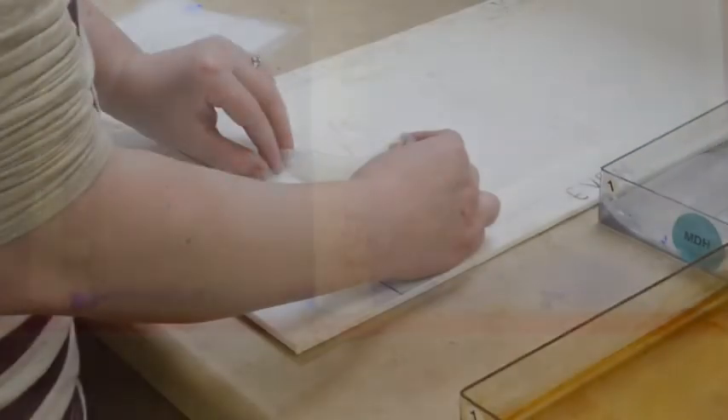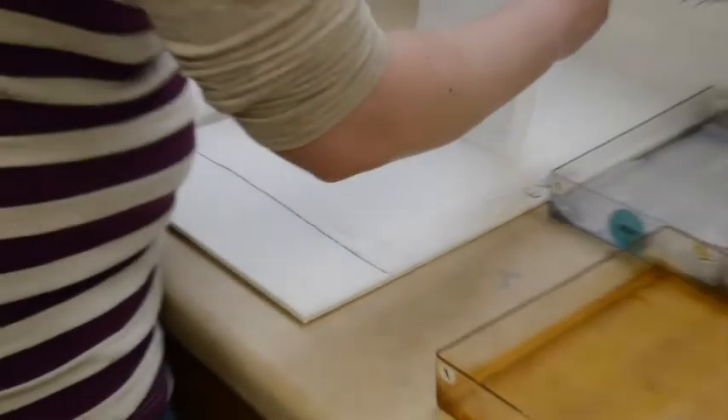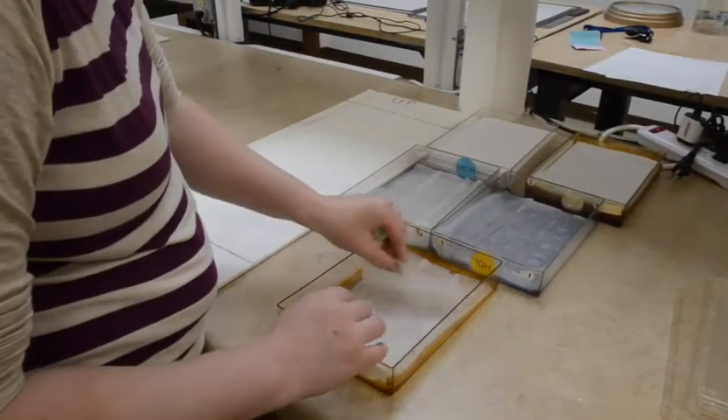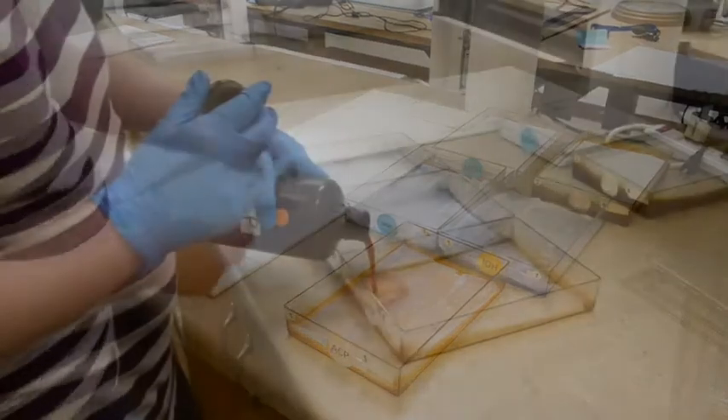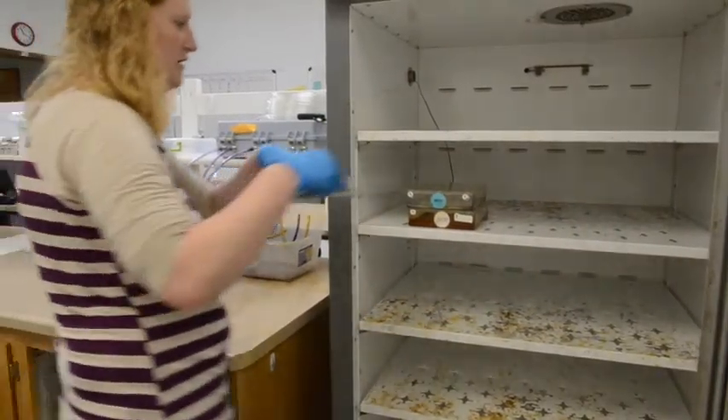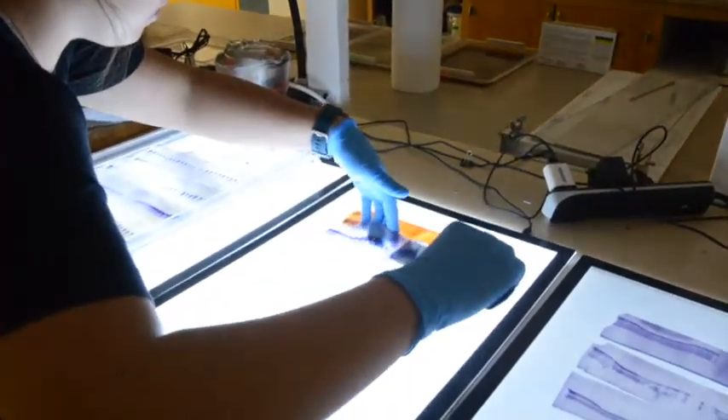When the tracker dye has moved a set distance, the gels are then sliced into multiple layers and transferred into separate stain boxes. A single layer is then stained for a specific isozyme and after incubation at 37°C we evaluate for genetic purity.